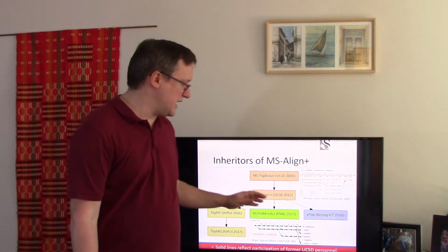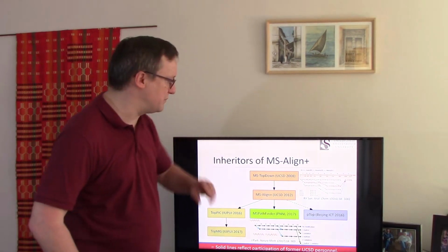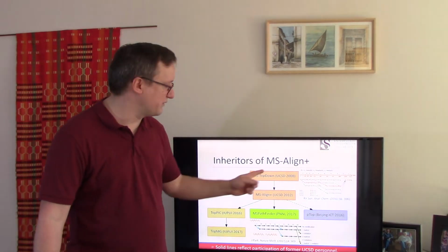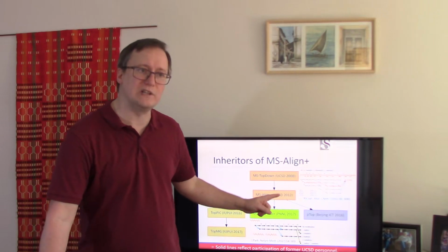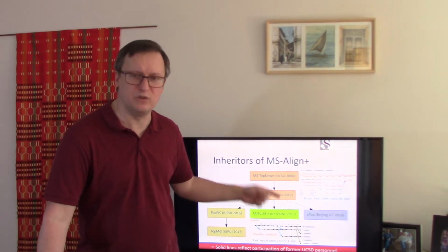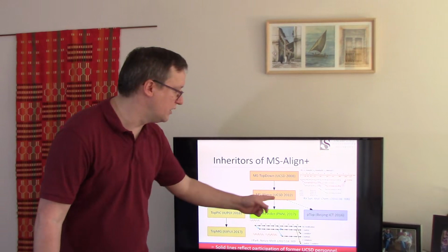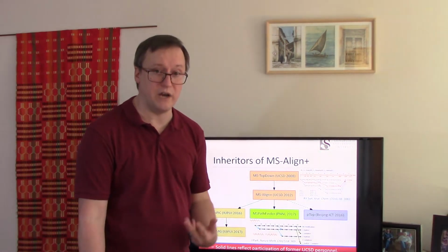Now, this approach has become rather ubiquitous in new algorithms introduced for this purpose. So we started with a paper from Ari Frank in 2008, which introduced MS-Top-Down. This is from the Center for Computational Mass Spec at UCSD. We saw that 4 years later, the algorithm was improved again by a fellow named Xiaowen Liu, who's going to show up in just a moment here. So he created some software called MS-Align+ while he was postdocing at UCSD. That software, in turn, has gone on to inspire a lot of other code.